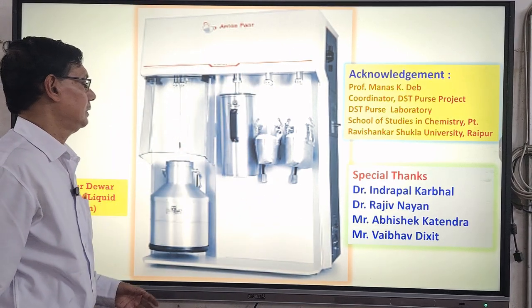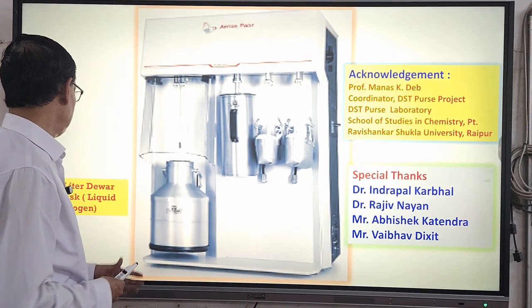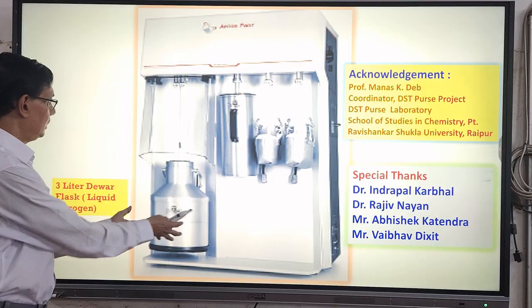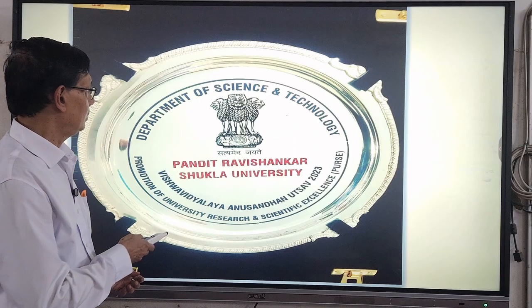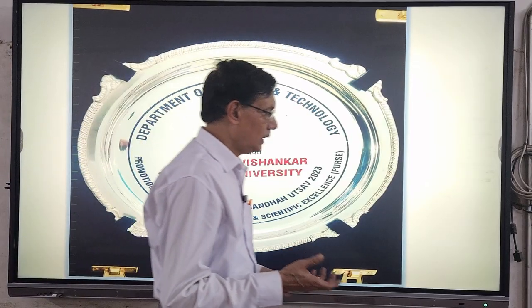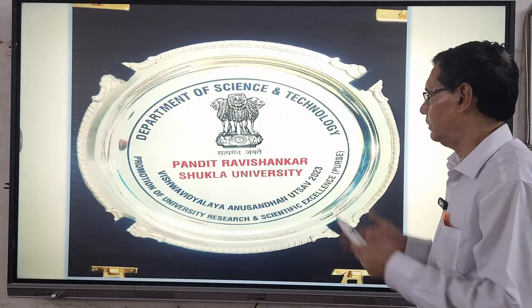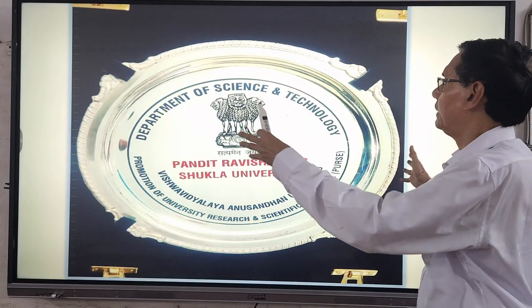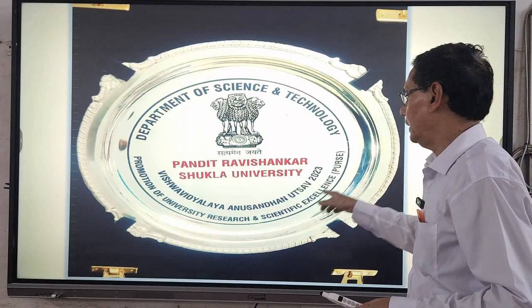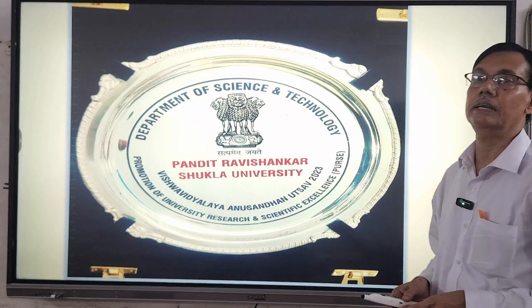They are all research scholars, and they will help me to perform this experiment. Now, I have no words to express my deep sense of gratitude to the head of the department also for providing me the facility, because this project comes under the DST PURSE, promotion of university research and scientific excellence.